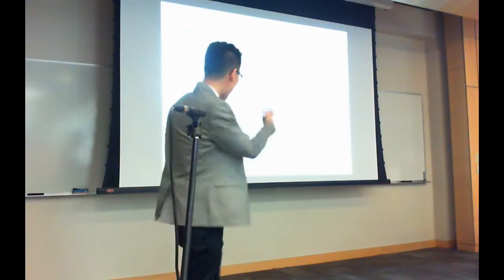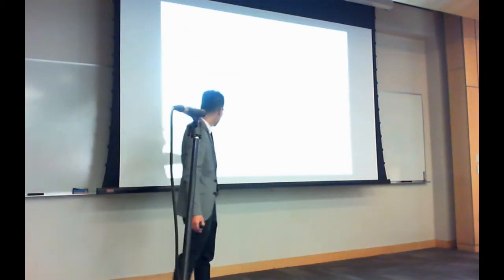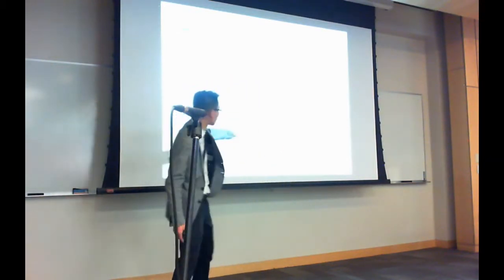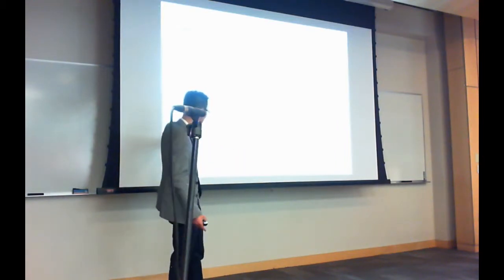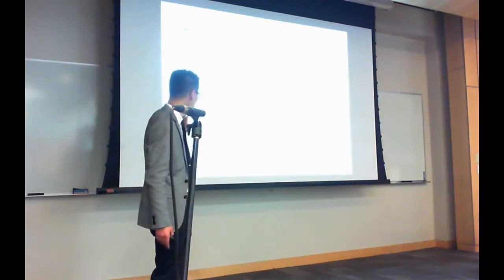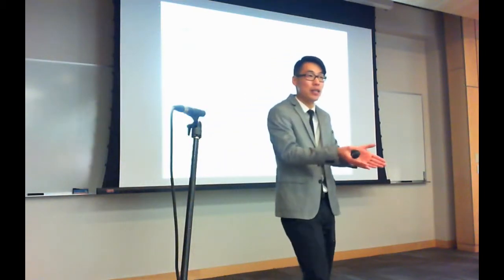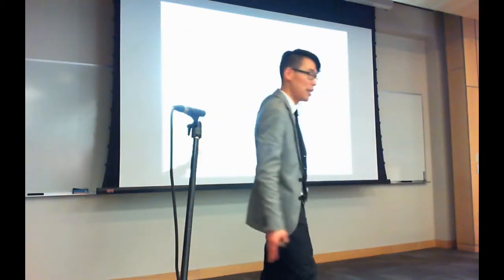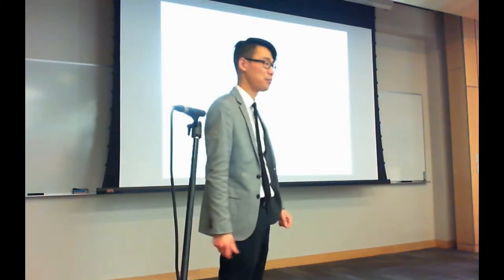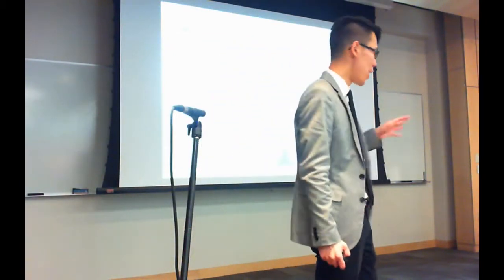And so how do we actually lower this score and make our confidence higher? The first way is you find higher quality spectra. If the spectrum is higher quality, it makes our spectral probability better, and it increases our confidence in the identification. You can also reduce the search space. If it's a synthetic peptide, there's only one possibility, and this is reflected in the exponent here, which will increase the confidence that you believe the identification. And so we use this concept as the primary score ranking for identifications.